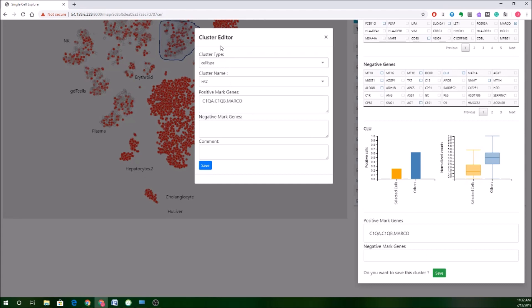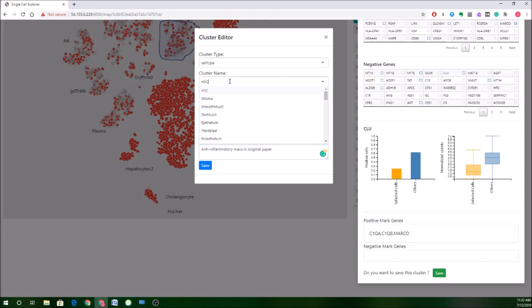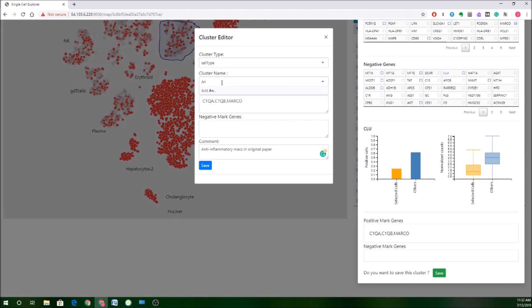Now, this gives you another option to add some of your annotations. So you have your positive marker genes, your negative marker genes, which were brought in automatically. You can add a comment. So I think in the original paper, these were thought to be more anti-inflammatory macrophages. So I'll say something like anti-inflammatory macs in original paper, and I can name them something. So we actually have some nice controlled vocabulary here, which can really help you if you're finding the same cell types over and over again. You can refer to them in a common way. If you don't find the one that you're interested in, you can actually add something. So I can say anti-inflammatory mac. And then I have the option to add that. And now that'll be part of the controlled vocabulary that folks can see in the future. So I click save here.